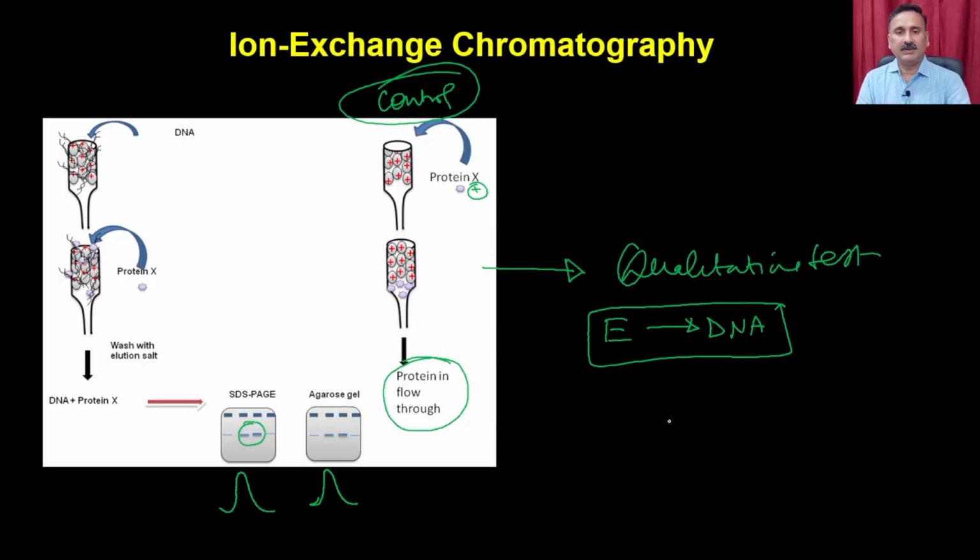Now let's move on to gel filtration chromatography, and I hope that you still remember the principle of gel filtration chromatography, right?